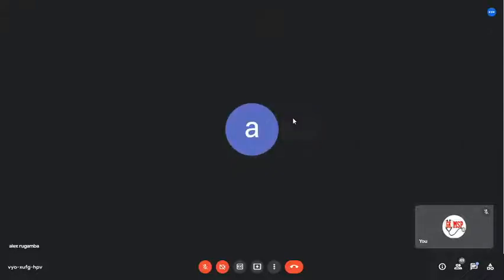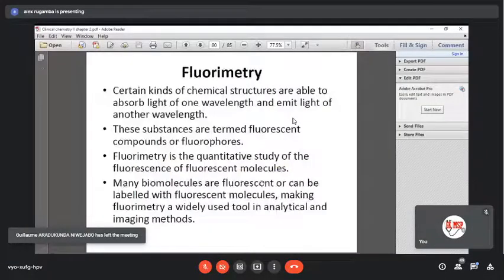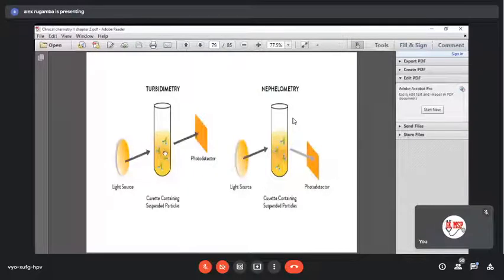The light, sample, detector. Then the reference. So transmitted light, the absorbed light, the scattered light, you know those terms. The absorbed light is the light which was absorbed in the sample. The transmitted light is the one which was transmitted. Like this one, some light may be absorbed here, transmitted, detected.